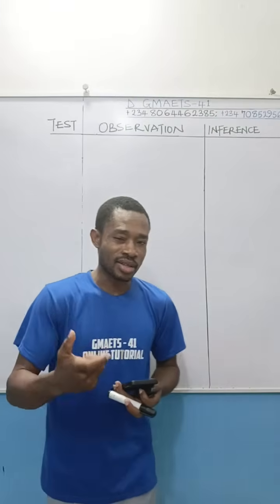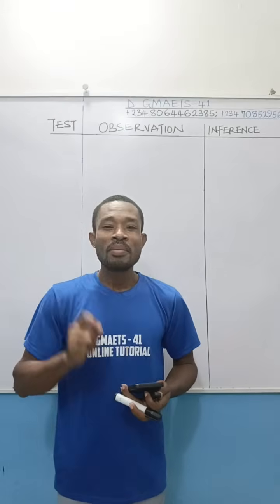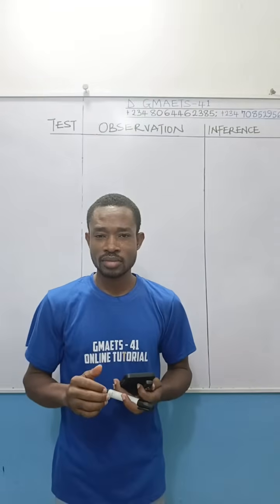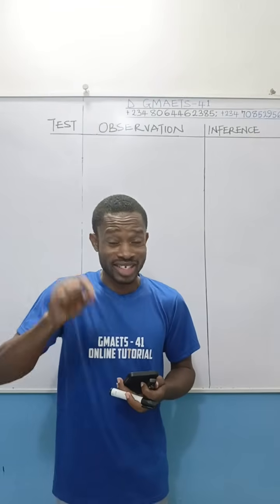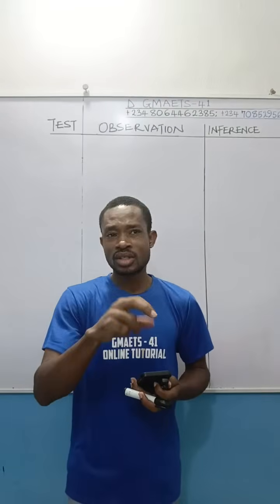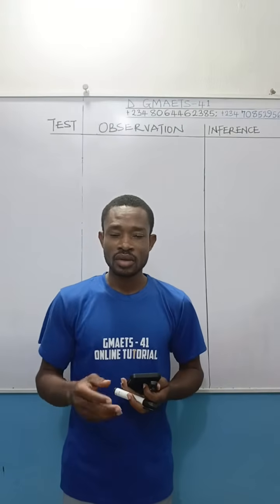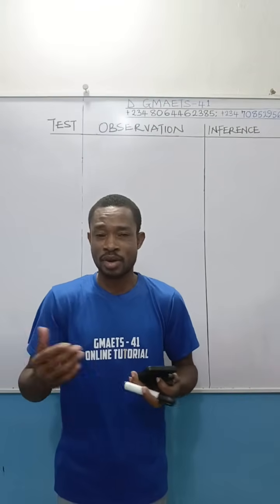Now, while you are taking these lessons, what should be your focus? Pay good attention now. 1. Memorize the reagents used for basic salt analysis, which includes sodium hydroxide and ammonia, basically. Then these ones are used to test for cations. Are you getting those positive ions like calcium ion, zinc ion, lead-2 ion, aluminium ion? We talk about copper 2 ion, iron 2 ion, and iron 3 ions. So these reagents, sodium hydroxide, ammonia, are used for them mostly in this experiment you're going for.